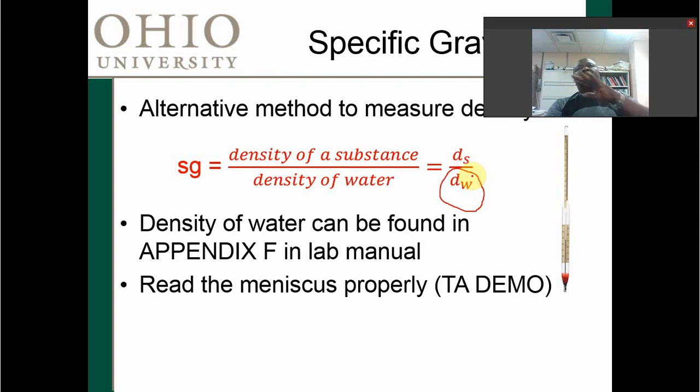Temperature, look up the appropriate density, and then you're good. And then in lab, we will determine this, and then we can solve for that.